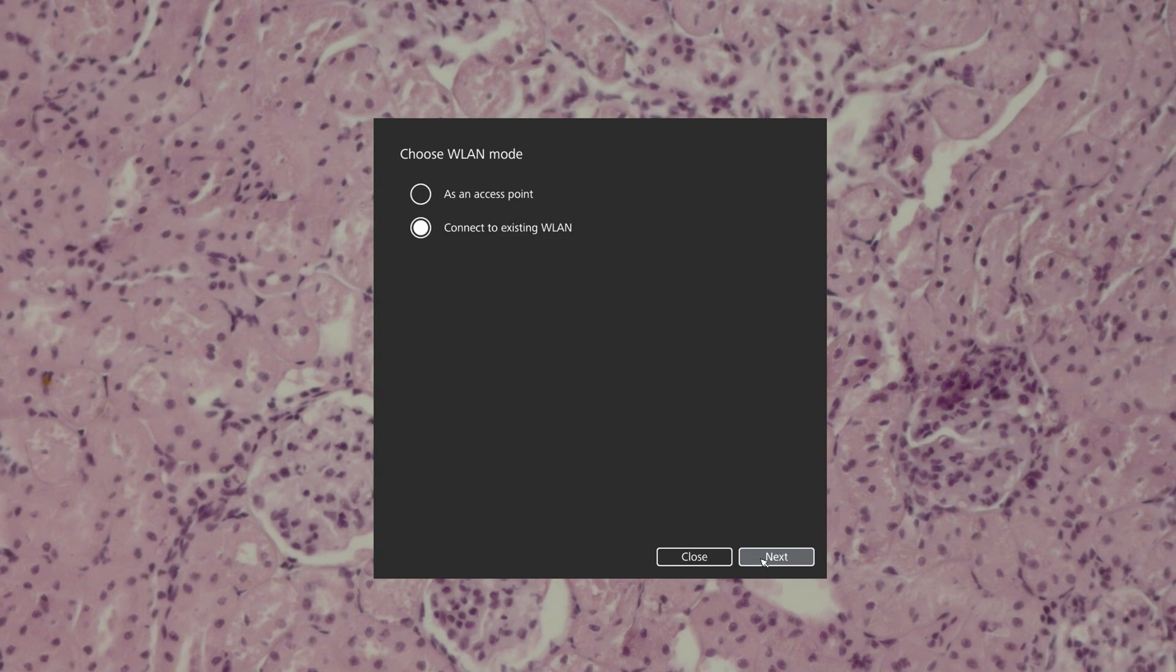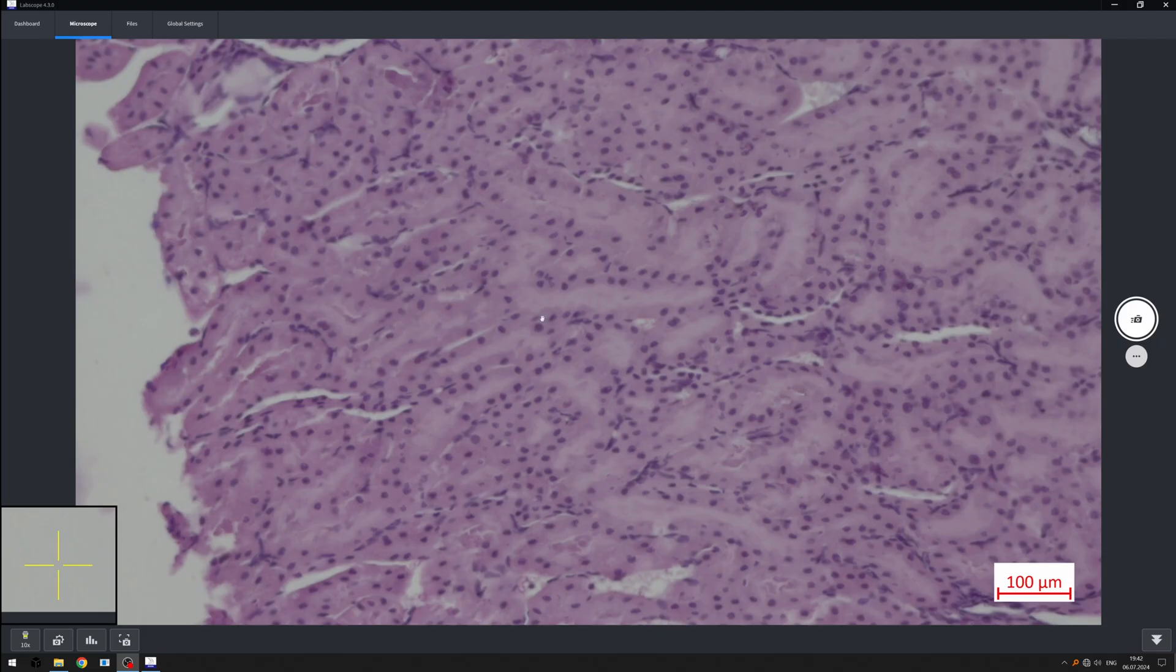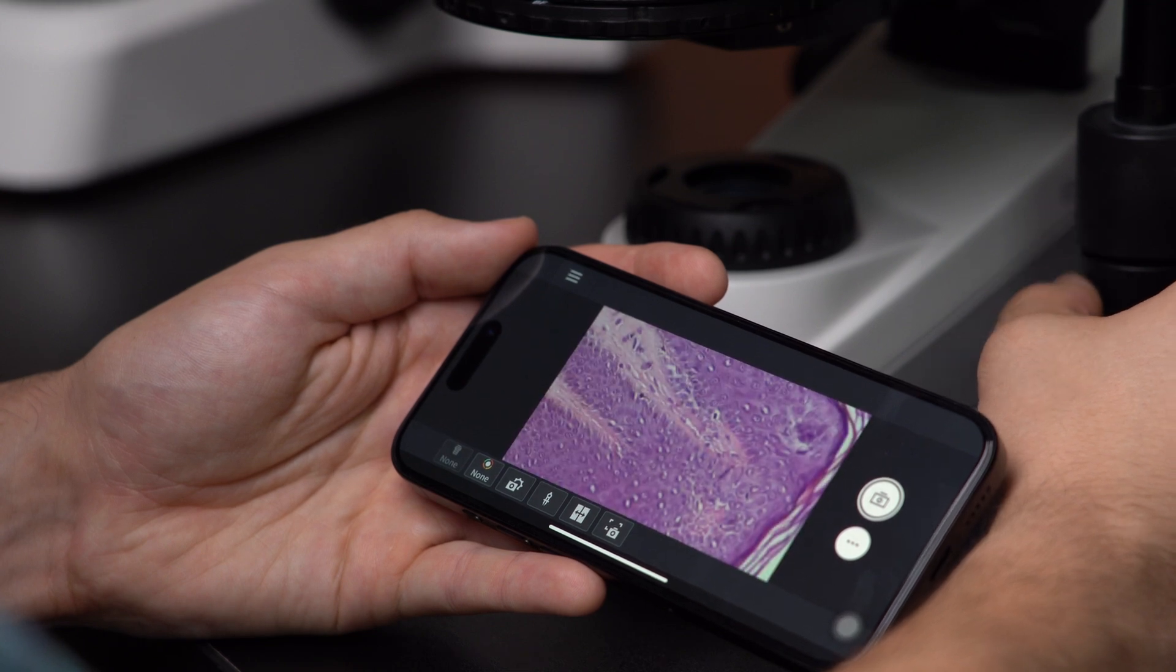In the Wi-Fi settings menu, we can connect the Axiocam camera to our local network. Select the network and enter the password. Now it should work. Disconnect your camera from the monitor and open the Labscope app. We're here. Now you can connect to the camera from any device on the local network.